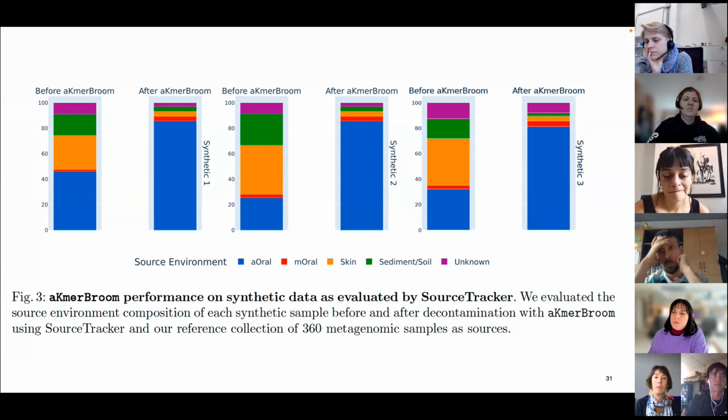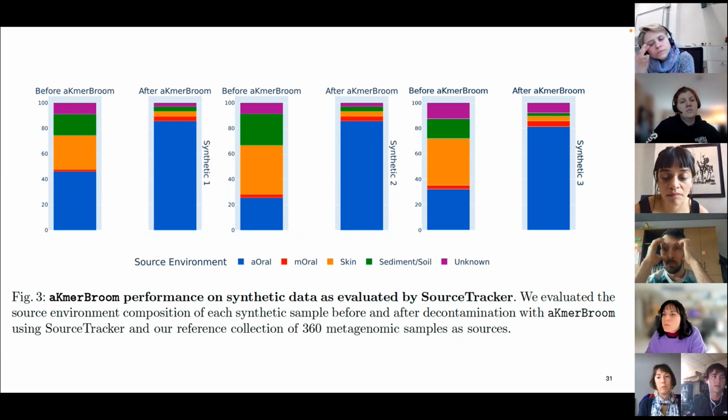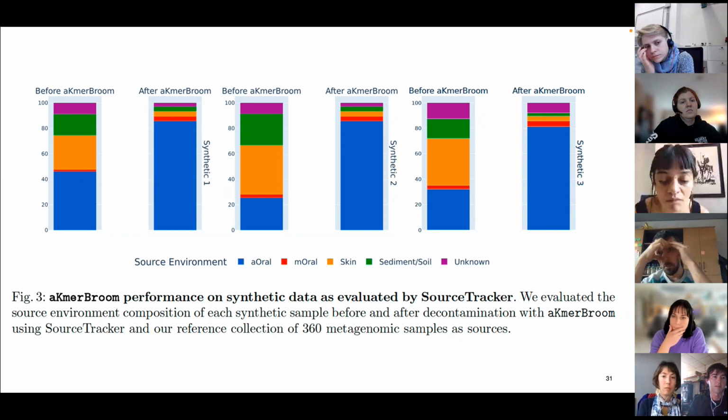Then you can compare whether those reads are being identified as contaminants in those sources, then do the taxonomic profiling to see what those reads are actually being classified as, and whether they are more oral or maybe a laboratory contaminant. Have you done or considered anything like that?